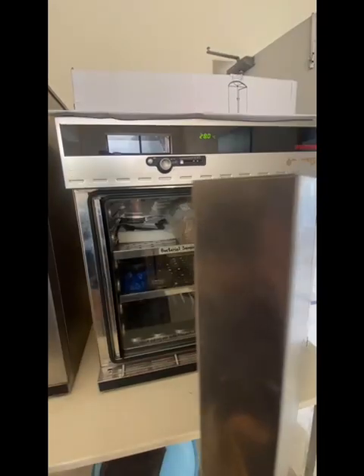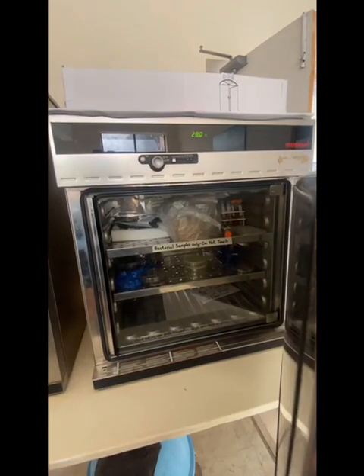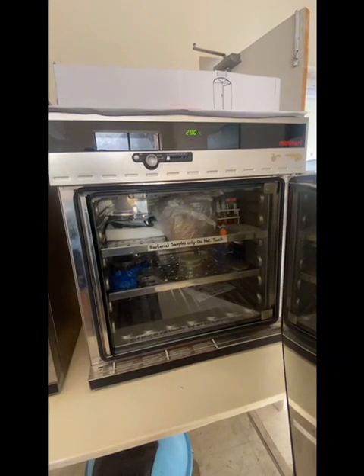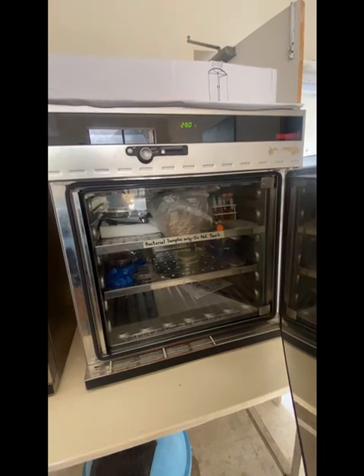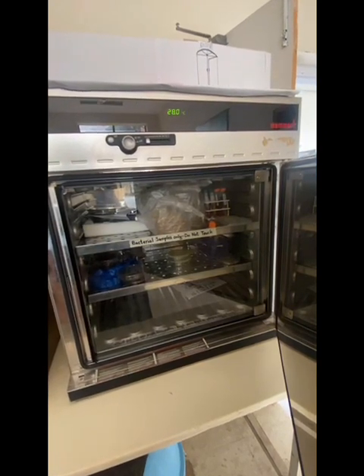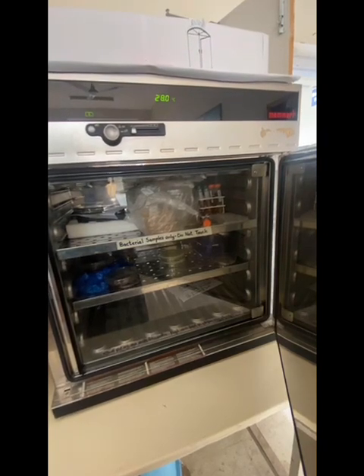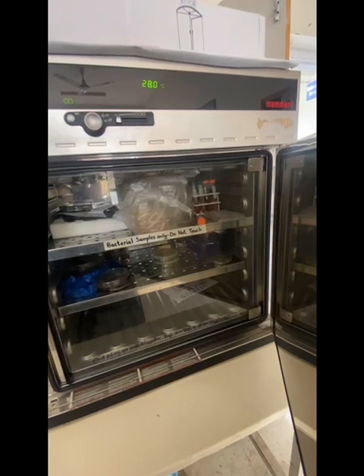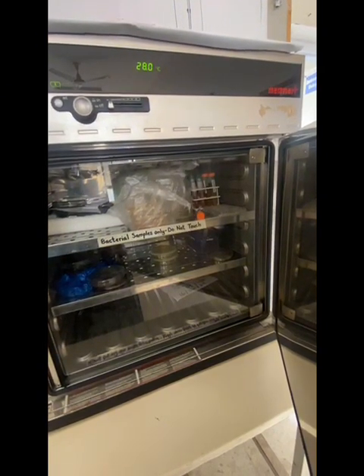Most growth incubators allow precise temperature control within a range typically between ambient temperature and 50 degrees Celsius, depending on the requirements of cultures being grown. Some models offer both heat and cooling capabilities for a wider range of applications. Certain cell cultures and microorganisms require specific humidity levels for optimal growth. Growth incubators often feature humidity control systems to maintain the desired moisture content within the incubation chamber.